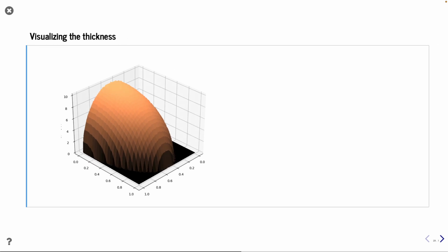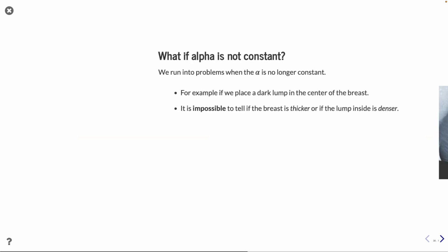And looking at the thickness profile, the interesting thing is, if you remember the original model, it was a half sphere, and now this is a kind of parabolic shape, and that is because we're going from, in principle, the first contact, so we're only looking at the distances, and they can never be negative. So we are just looking through the shortest distance, and that's from 0 to some thickness.